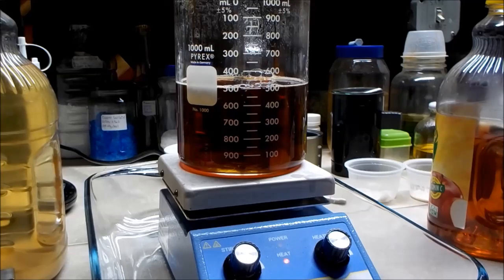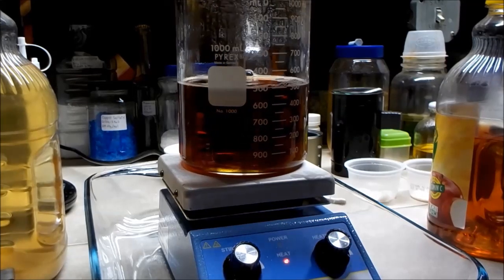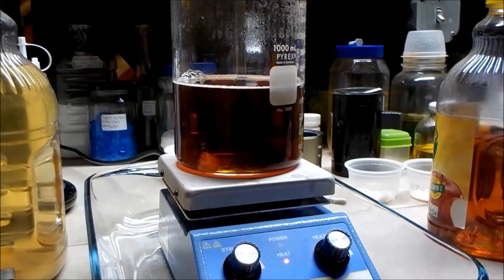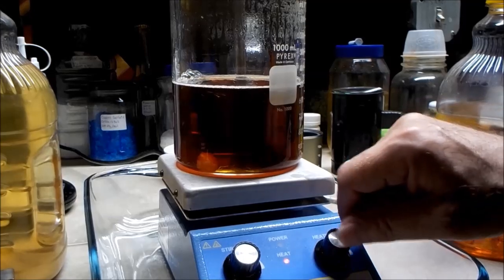It's reduced down to about 500 milliliters again and I'm noticing that there are some crystals that have formed — tiny needle-like ones floating around in there; the camera may not be able to see them. At this point I'm going to turn off the heat, let it cool down, and see what crystals may form when it cools.